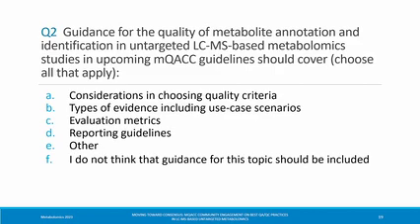Depending on the instrument we're acquiring data on, let's say, for example, the Thermo QE, we'll do stepped collision or normalized collision energies of like 20, 30, and 40. In previous experiments, I usually did PRM methods or different ways of acquiring MSMS data at different collision energies, because when you're processing the data, you can actually separate the different collision energies. So I do have a lot of interest. Like I said, I'm the librarian of the lab, so if you wanted to discuss how to acquire library data, I'd be happy to talk about that.